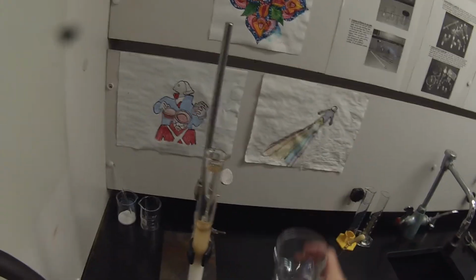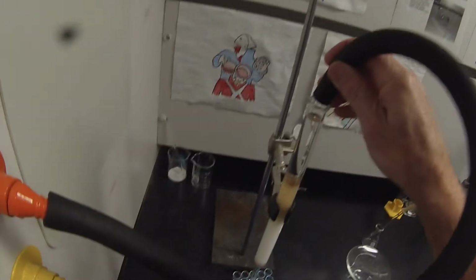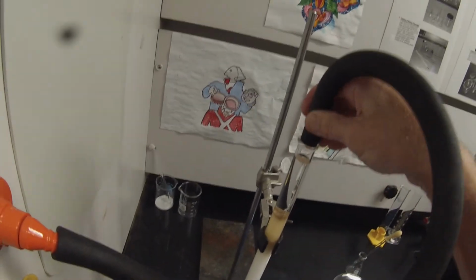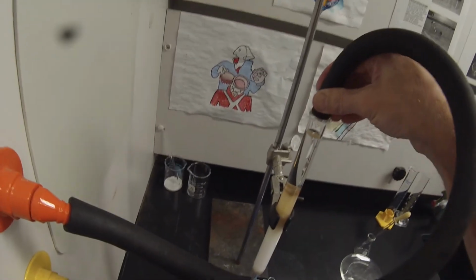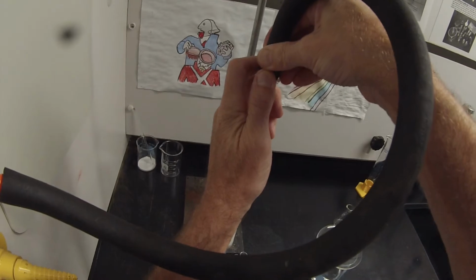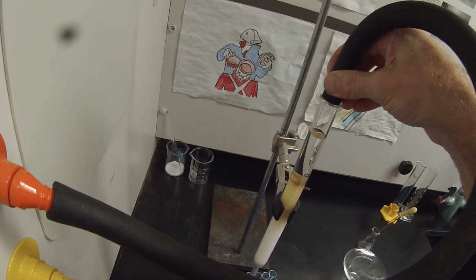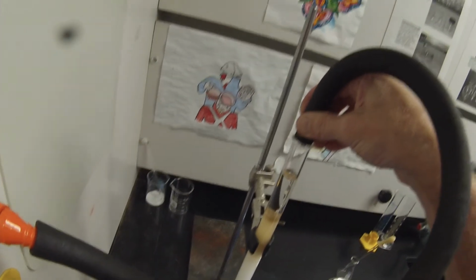In the real world, of course, you have needle valves and pressure adjustments and all kinds of sophisticated equipment. It makes this a little bit of a cleaner process. But we can still get decent separation even with our rather limited tools, as long as the RF is different enough.